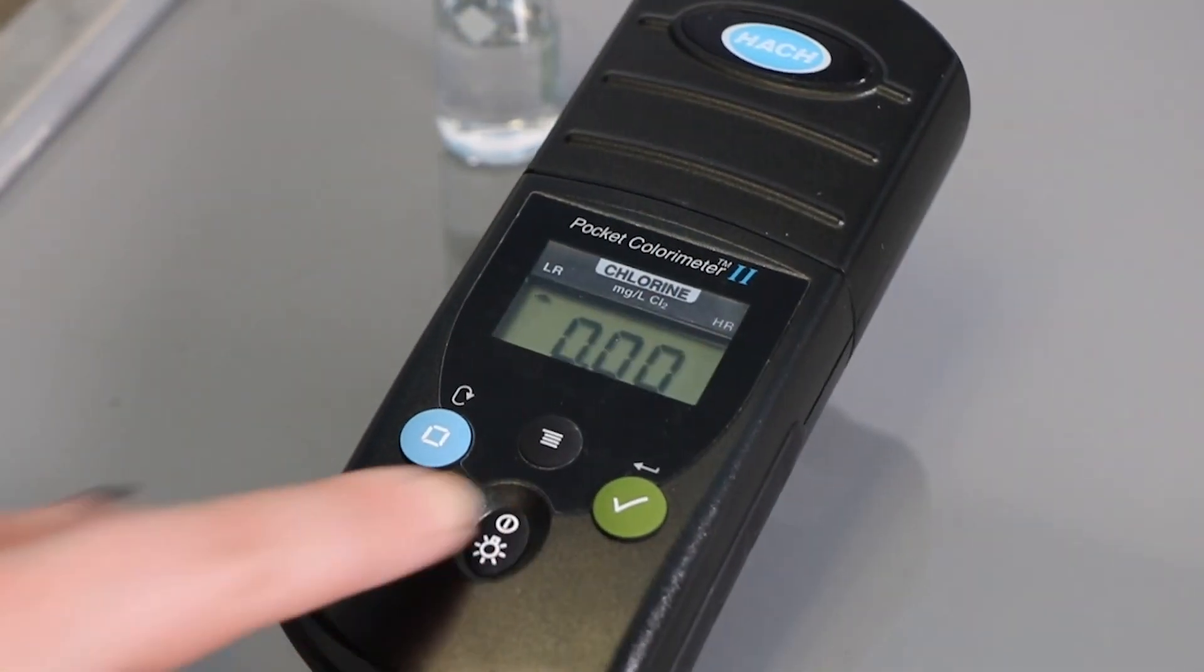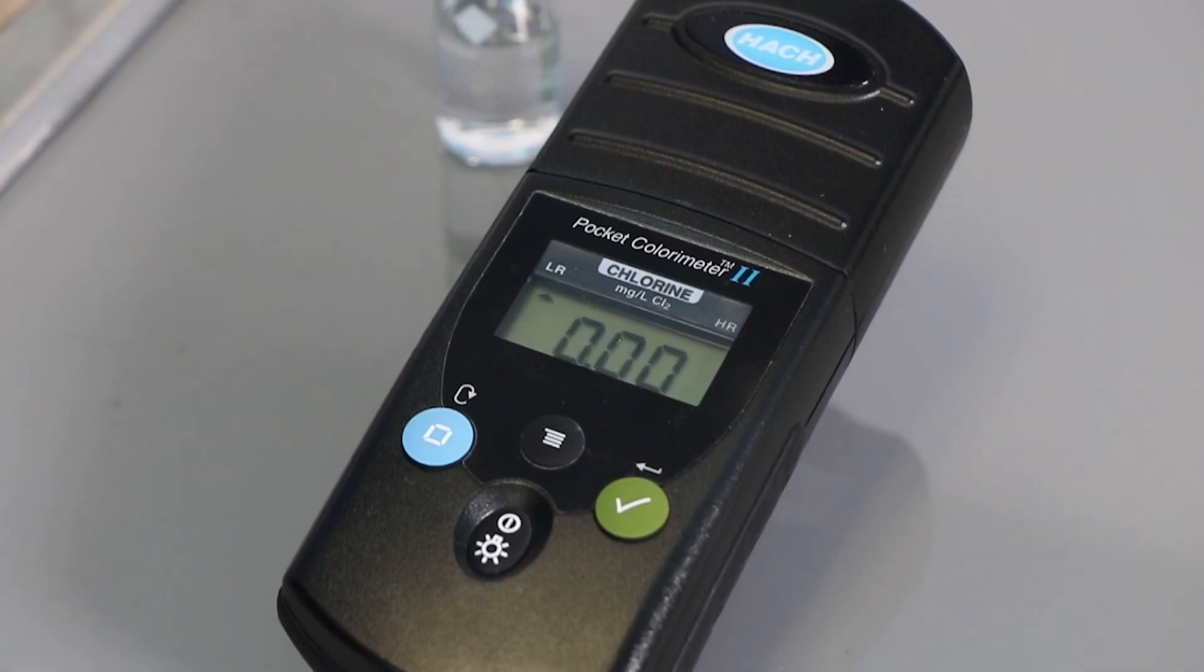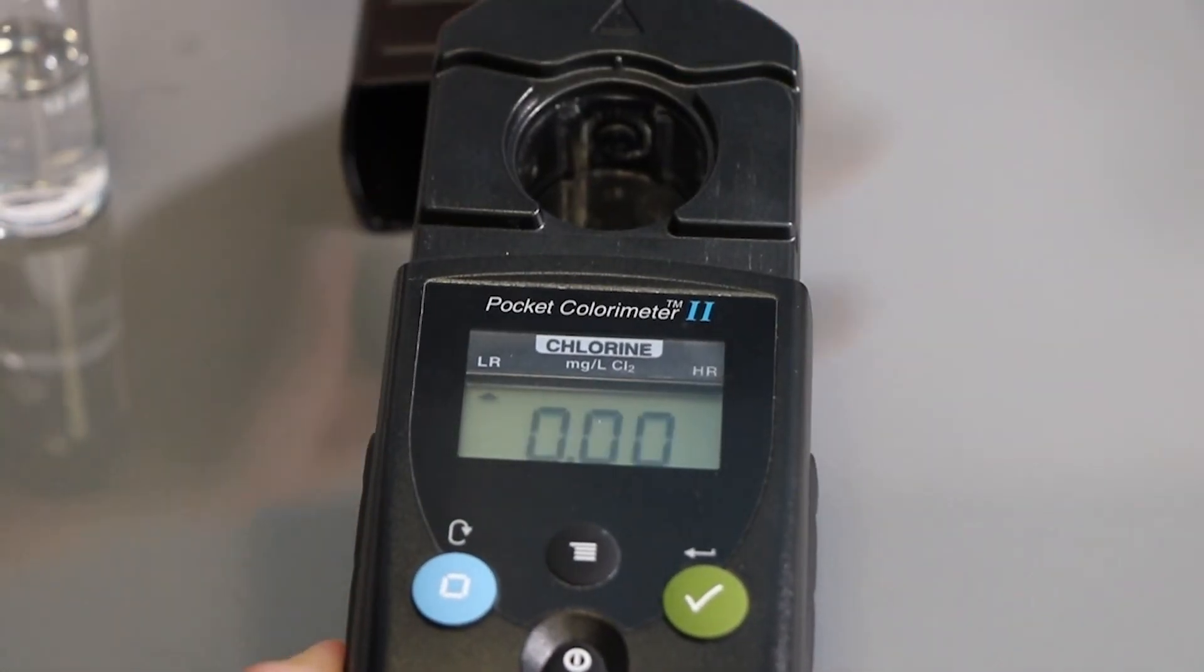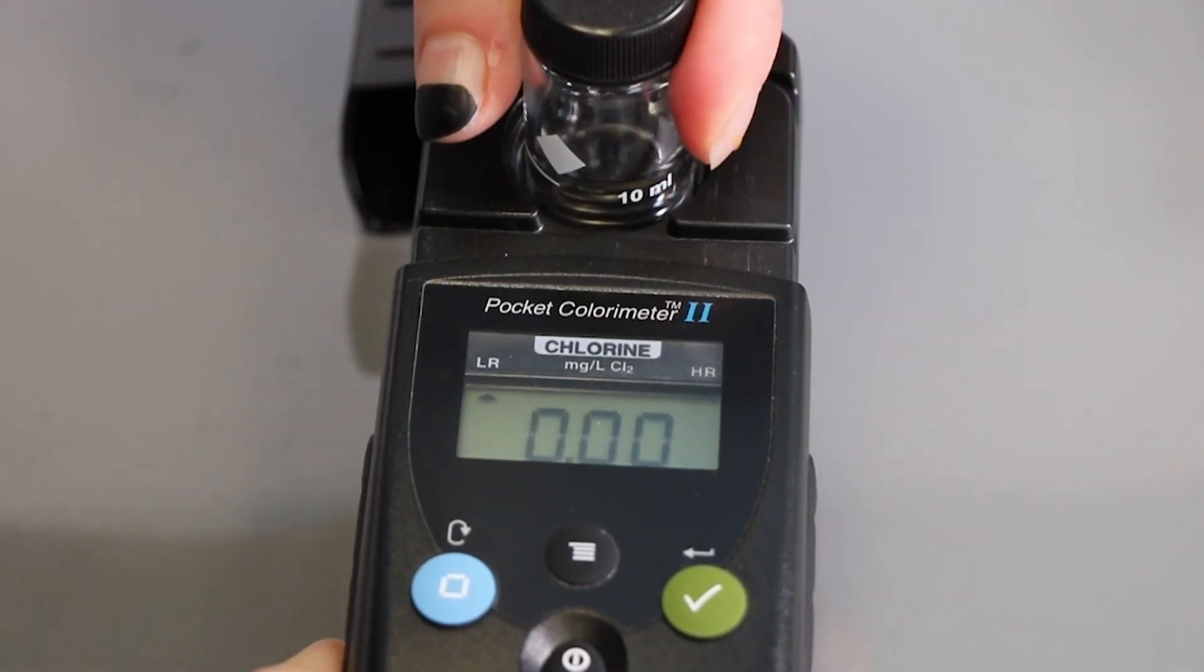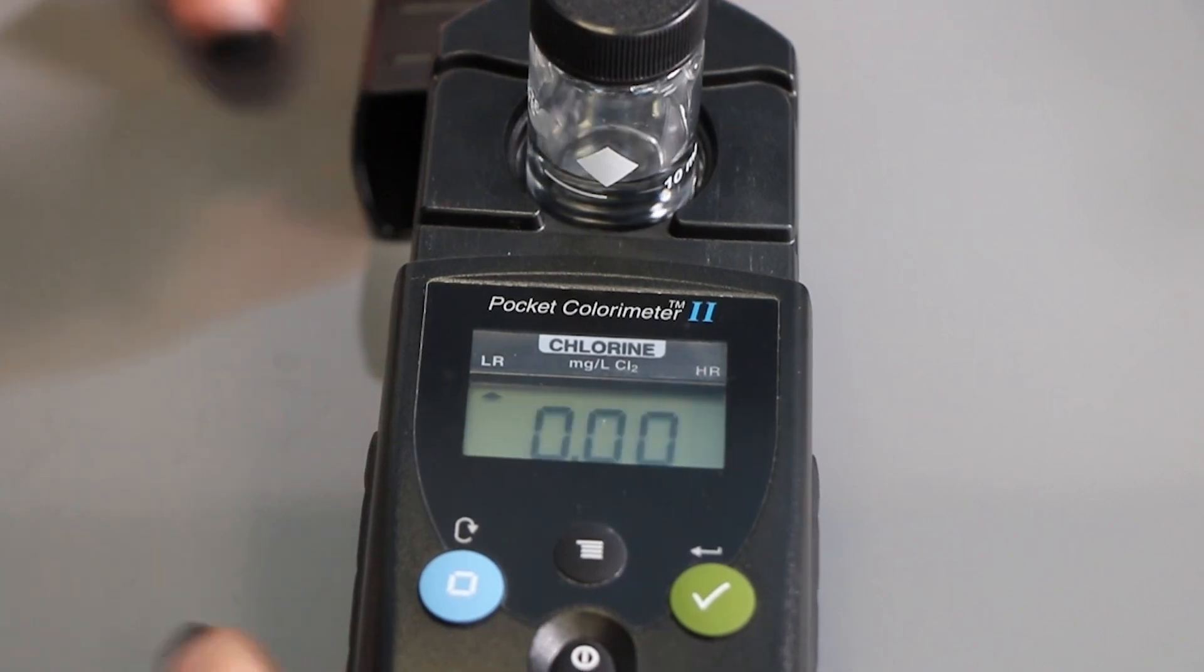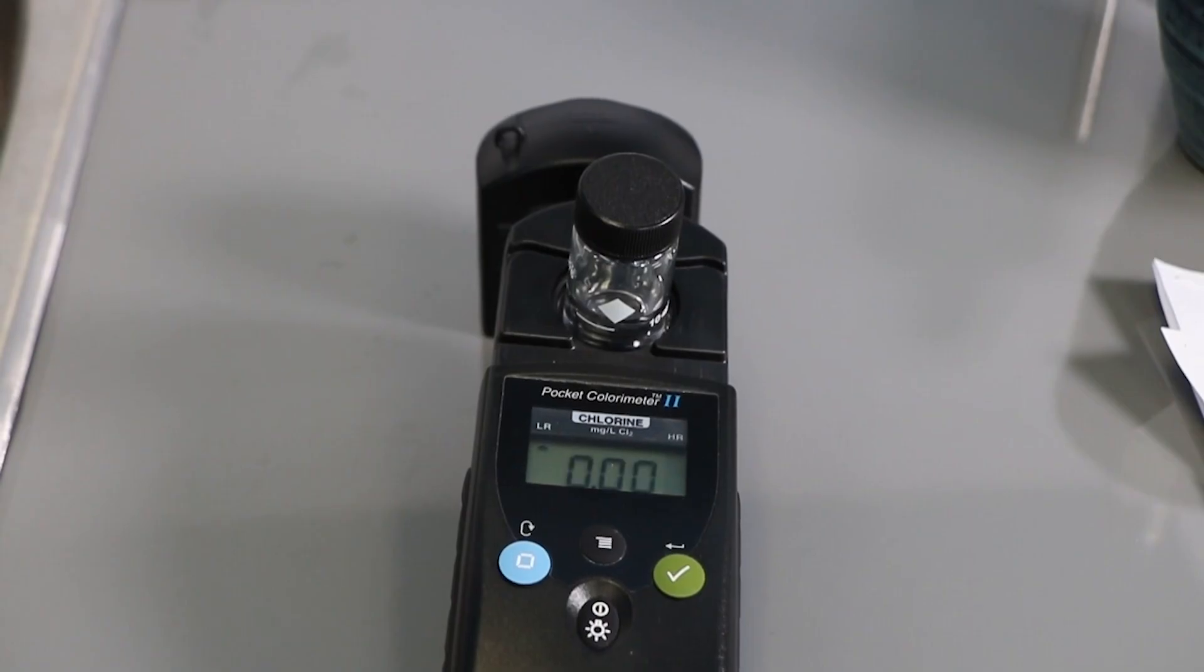Turn on the meter. Remove the cover from the pocket chlorometer and place the sample vial in the measuring chamber. Make sure the diamond-shaped marker is facing towards the screen. Replace the cover.